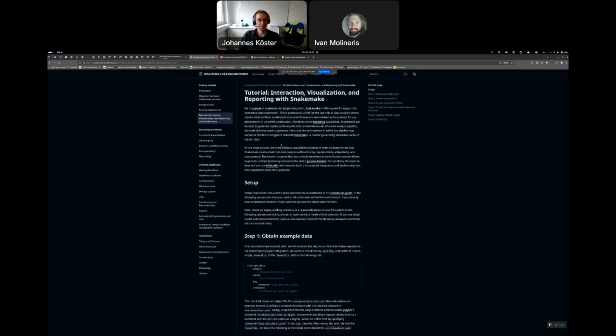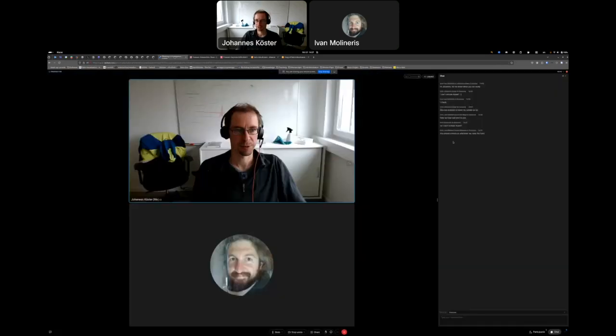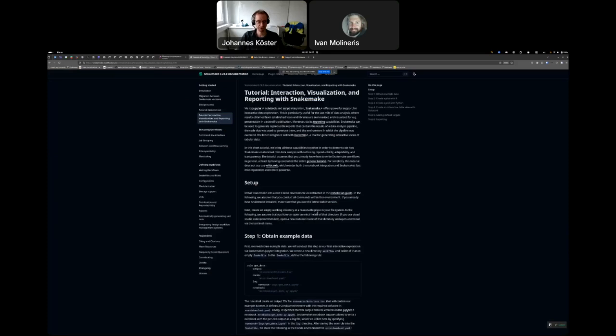So with that, I would like to start. So first of all, let me post the tutorial URL in the chat. I intentionally wrote everything down like a script for today, so that you can also read things up afterwards if you weren't able to follow every single word that I said, and check out individual steps later on if something wasn't clear or didn't work for you or whatever. So in principle, you're able to also conduct the tutorial at your own speed after this hands-on seminar.